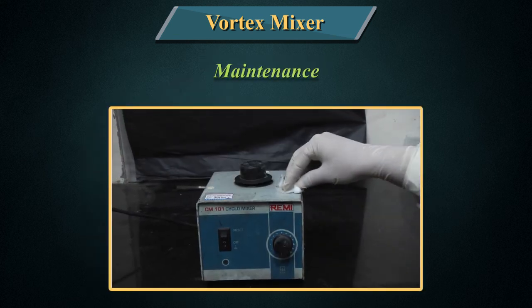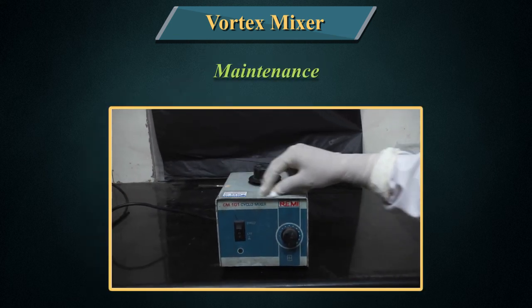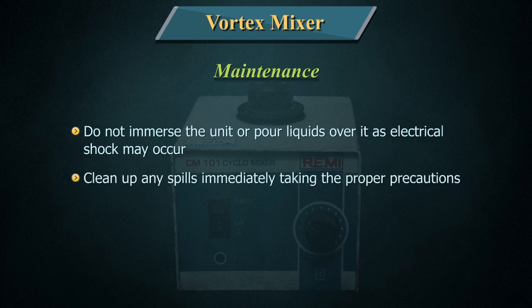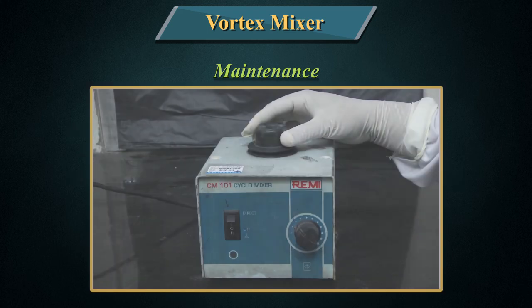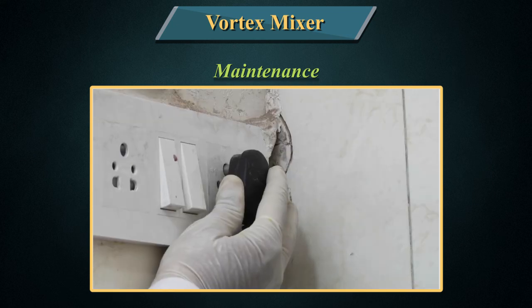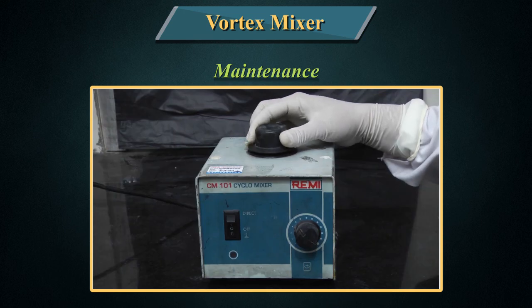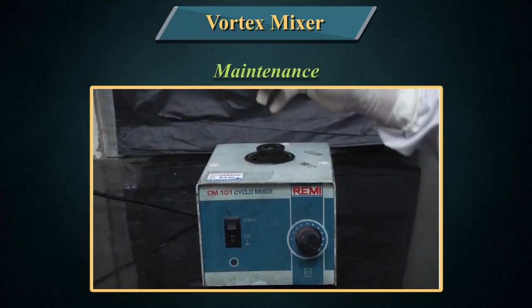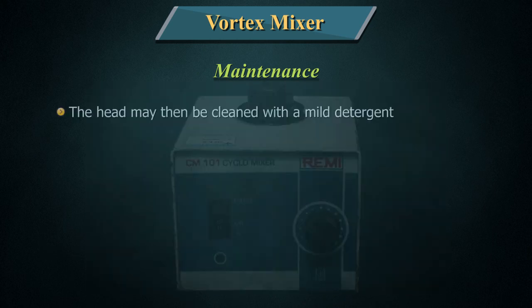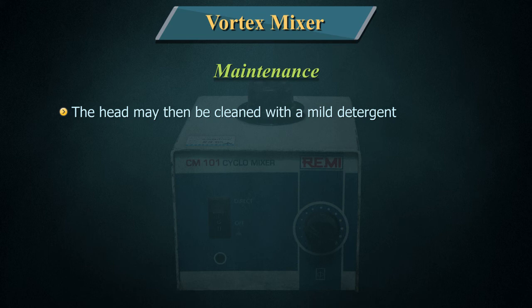Maintenance: After each use, wipe down the mixer with a soft cloth. Do not immerse the unit or pour liquids over it as electrical shock may occur. Clean up any spills immediately taking the proper precautions. If required, the shaking head may be removed — first disconnect the vortexer from the power source and then remove the combo cup head by holding the housing securely while pulling up on the head. The head may then be cleaned with a mild detergent.